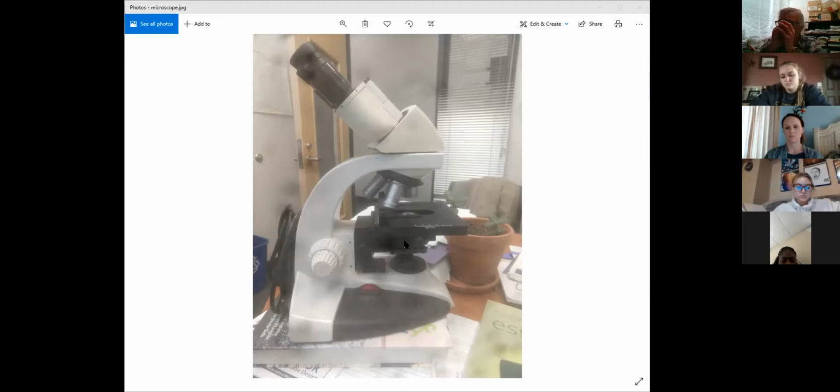And it's like the f-stop in a single lens reflex camera. Makes a big opening or a small opening. And the bigger the opening, the more light comes into your eye, the smaller the opening, the less light comes into your eye. And so sometimes you have to open up the diaphragm a little bit going into high power because there's less light coming into your eye.